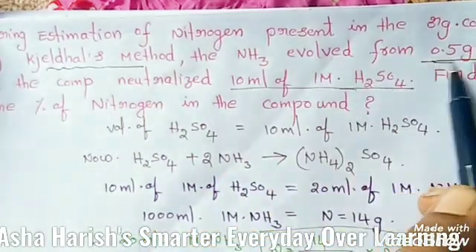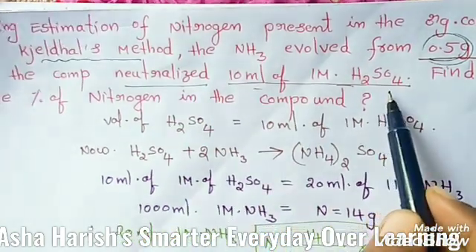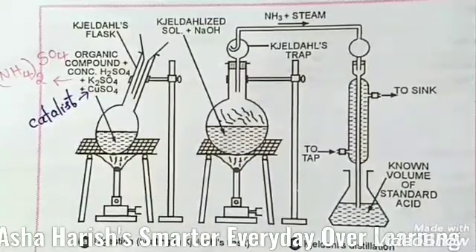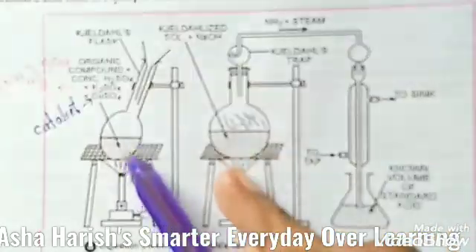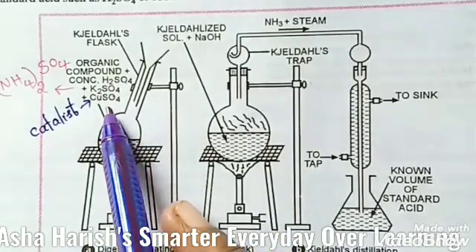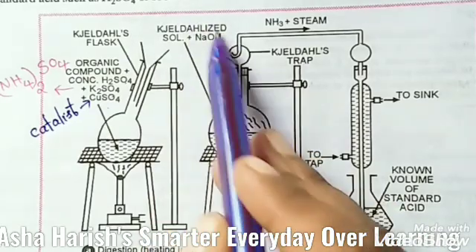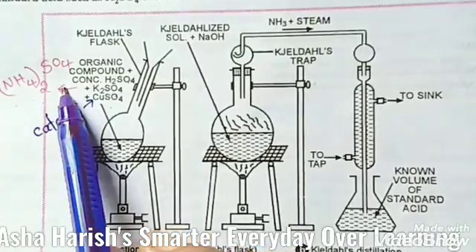The NH3 evolved from 0.5 grams of the organic compound is neutralized with 10 ml of 1 mole of H2SO4. Now this is the percentage of nitrogen. This is the entire apparatus for estimation of nitrogen by Kjeldahl's method. Here you can see the starting Kjeldahl flask with the organic compound, concentrated H2SO4, K2SO4 and CuSO4. Potassium sulfate and copper sulfate also we have to take. After the process of heating, the Kjeldahlized solution will come, which is nothing but (NH4)2SO4, ammonium sulfate.